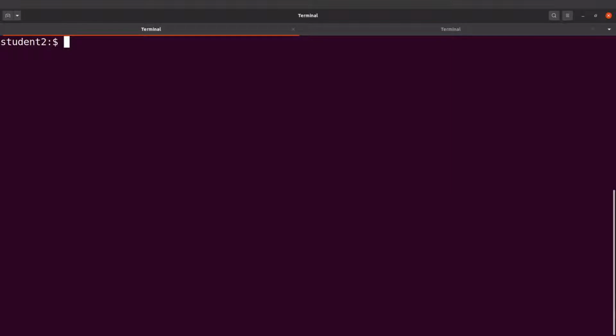So let's proceed. Now, before we edit the .bashrc file, it's advisable you make a copy of it. It's a backup. So I'll say cp .bashrc .bashrc.back. It's just a copy. Make sure you are in your home directory. If you are not in the home directory, make sure you use the cd command to go to your home directory.